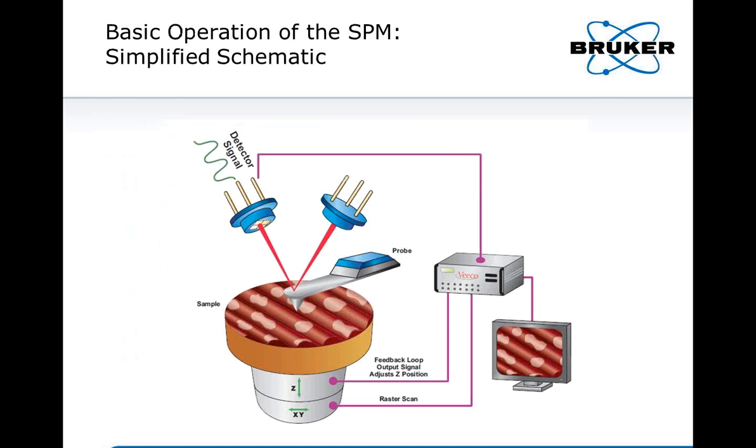So, the basic operation of the AFM, the SPM. Shown here is the basic schematic diagram of the scanning probe microscope, or SPM. For all it enables, the basic operation of the SPM is incredibly simple. So simple that AFMs have been made out of Lego and can also be found in high school science fairs. However, don't let that fool you about the power and the sophistication of state-of-the-art AFMs. The underlying physics of many modes of operation is still not fully understood, and the technology and intellectual property contained within every system is staggering.